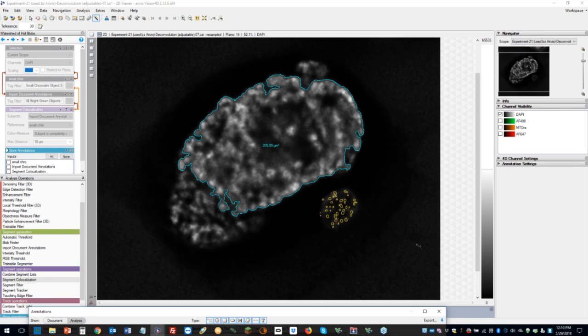It might be that the clearing is not optimized, or the imaging parameters are not optimized, and so what you're seeing is some out of plane optical issues. There are some cases where we can account for that, and then focus just on the regions of what I consider to be truth.